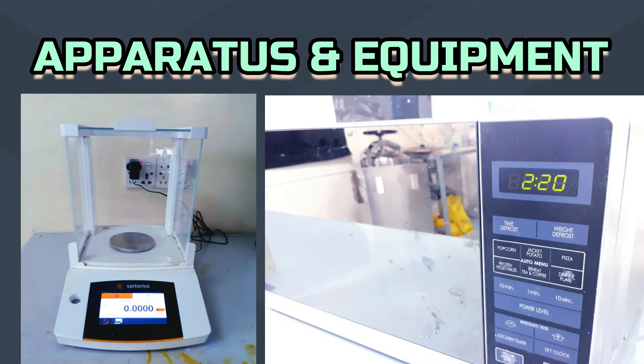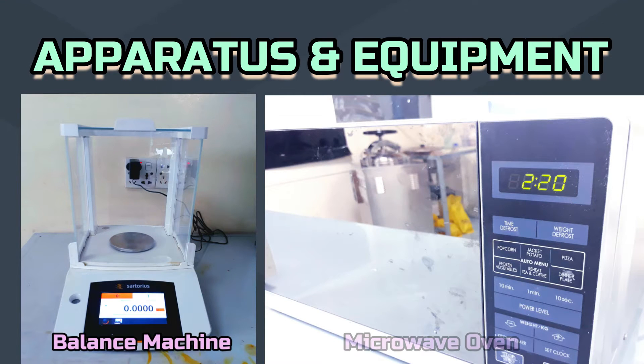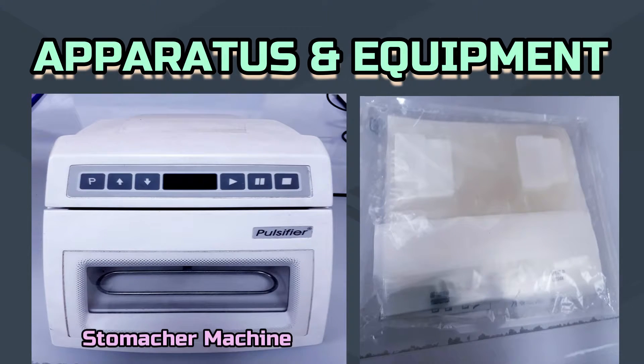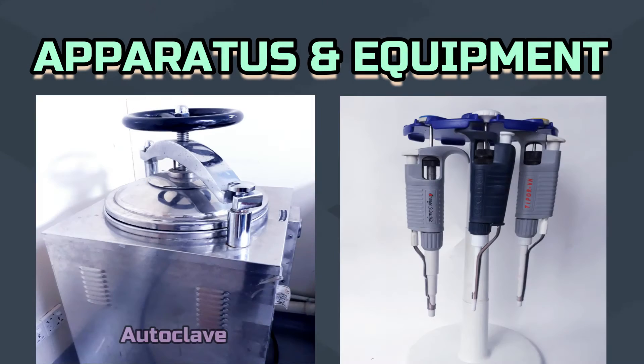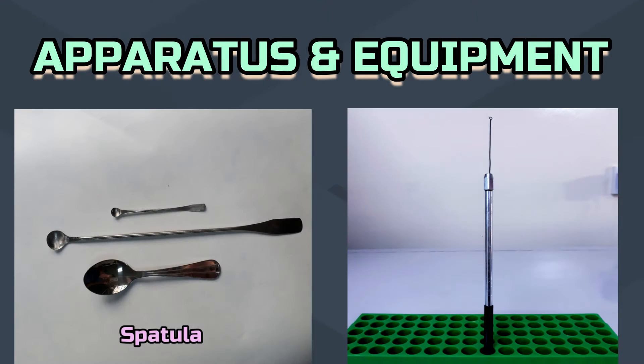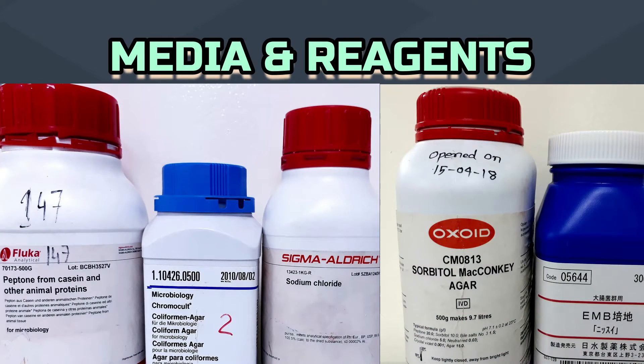To conduct the experiment, we need a balance machine, microwave oven, biological safety cabinet, incubator, stomacher machine, stomacher bag, autoclave, micro pipette, petri dish, pipette tips, spatula, inoculating loop, peptone, sodium chloride, chromocult coliform agar, eosin-methylene blue agar, and sorbitol McConkey agar.